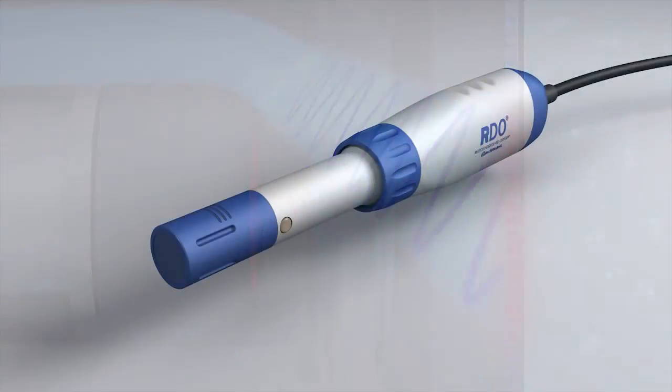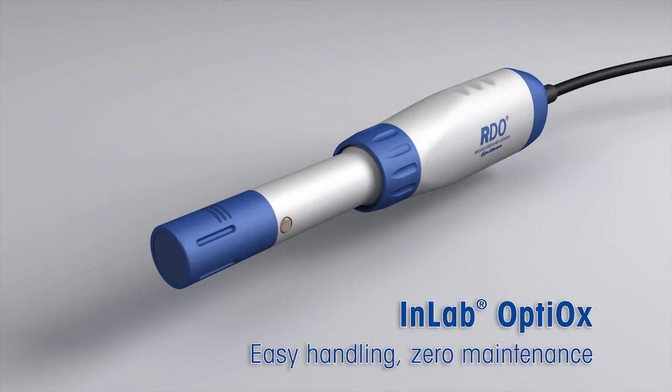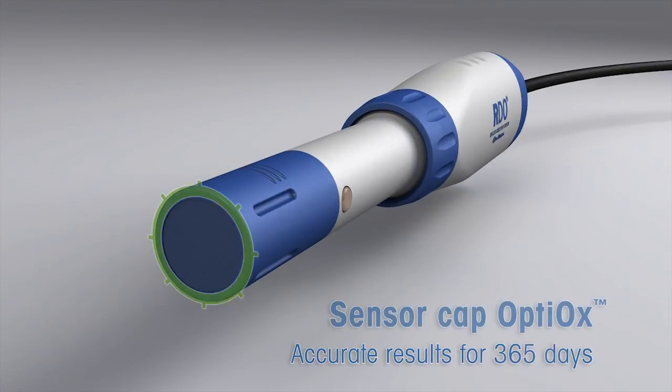In contrast to the fragile membranes of other sensors, the Optiox sensor cap is very robust. To guarantee optimum performance, the sensor cap has a maximum lifespan of 365 days. An internal clock informs you when the next cap replacement is due.